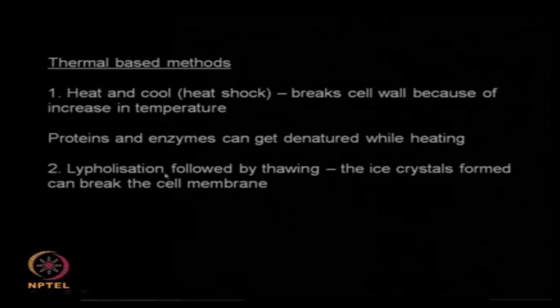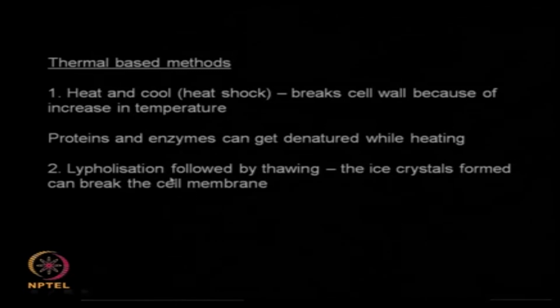So this is a good method because you are not using high temperature, so your biomolecule will not get denatured, but then the energy cost is also very high. But there are lyophilizing systems and thawing systems available which can help you to break cells of small quantity.